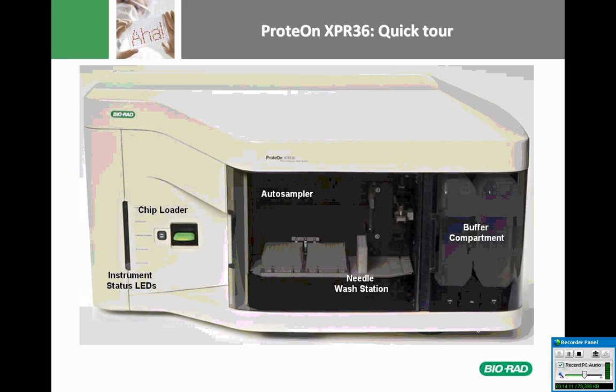So just a quick tour over the instrument. This is a front view of it. In the middle there is the autosampler where you put your samples. On the right side is the buffer compartment. Remember, there is always a continuous flow of running buffer, and you have place for 2 running buffers, which you can switch between easily, either by the buttons here below or from the software.